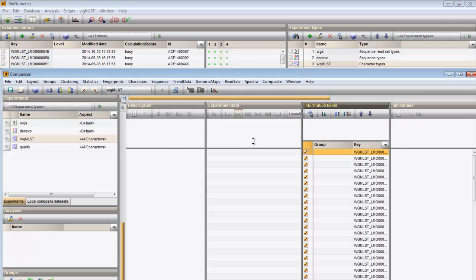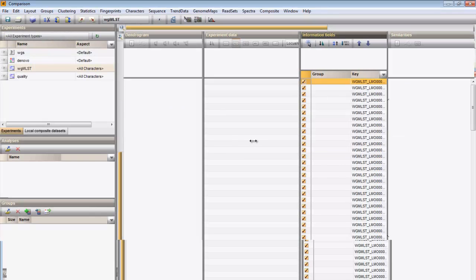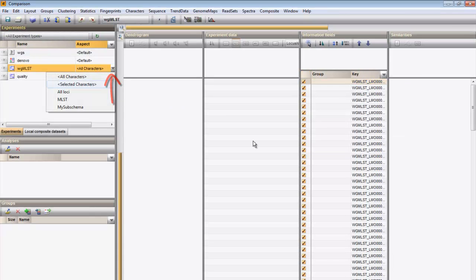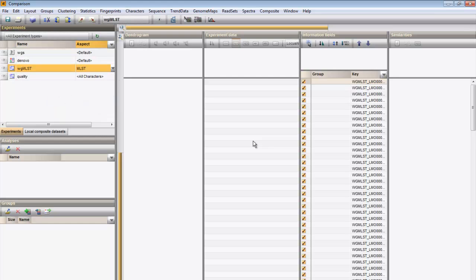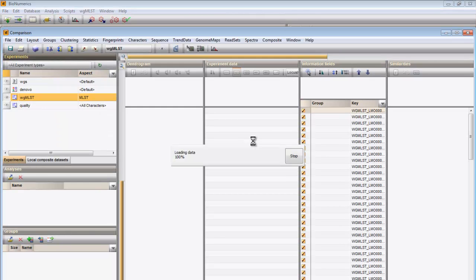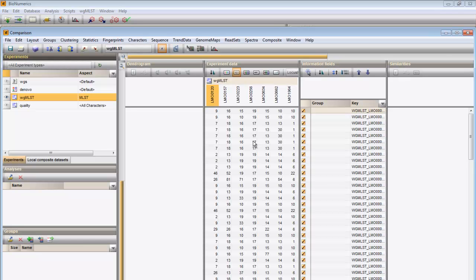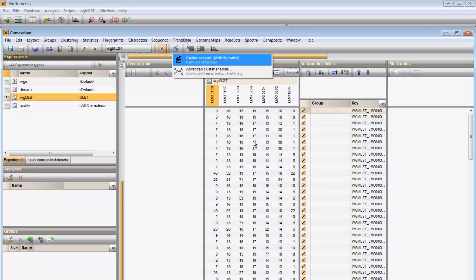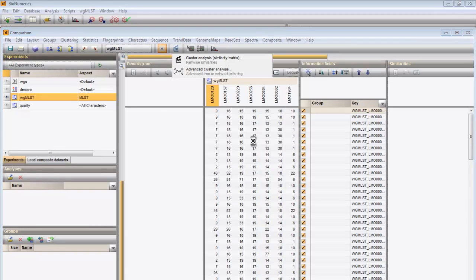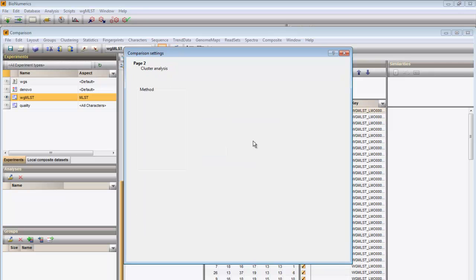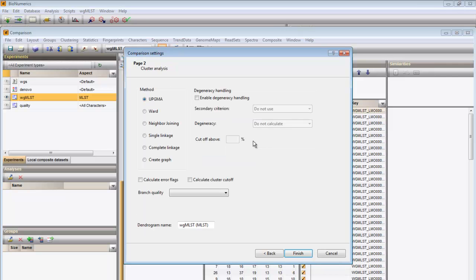This time, I will use only the allele numbers of the classical housekeeping genes. I calculate similarity values using the categorical coefficient and I visualize them in the UPGMA tree.